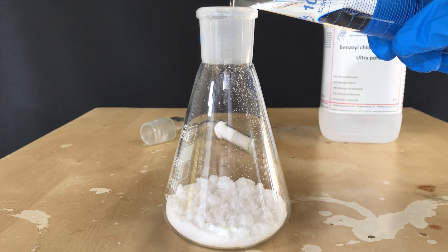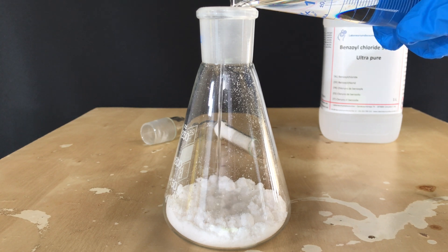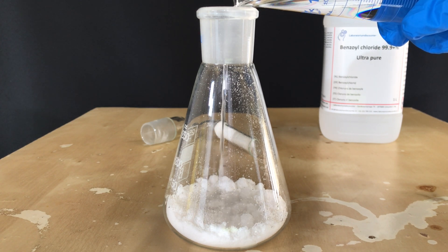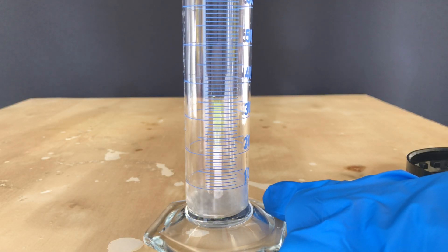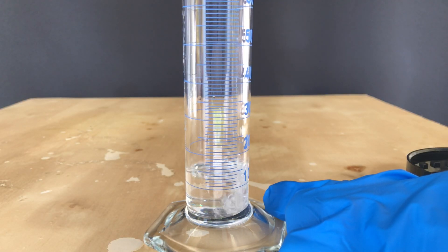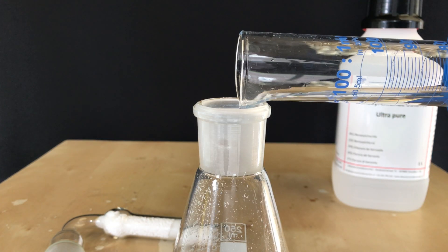I was careful at first because I thought maybe the oxalic acid still contains some water and this could lead to a runaway reaction, but I added it and nothing bad happened. As this was a 100ml measuring cylinder, the rest was measured out in a second run. You can again see how little the benzoyl chloride fumes.